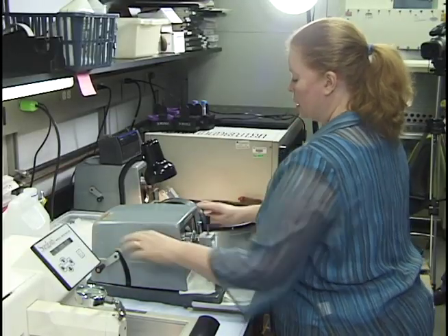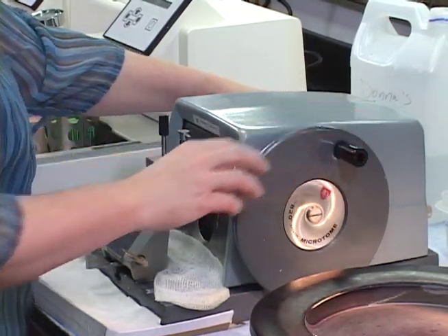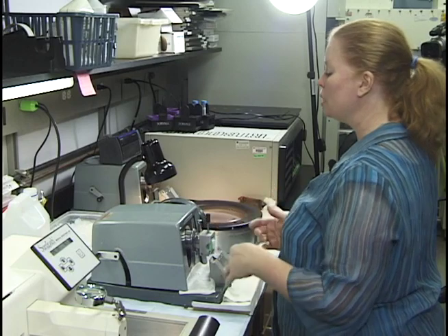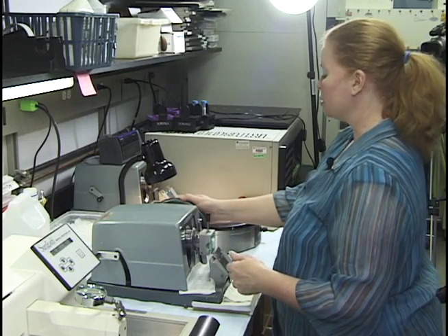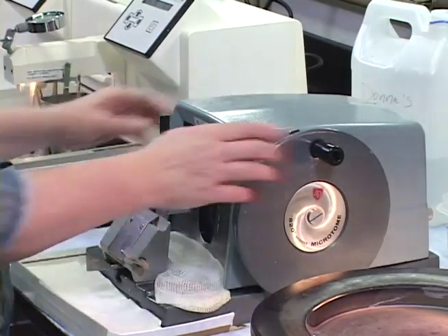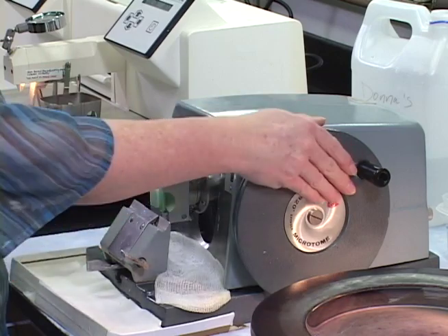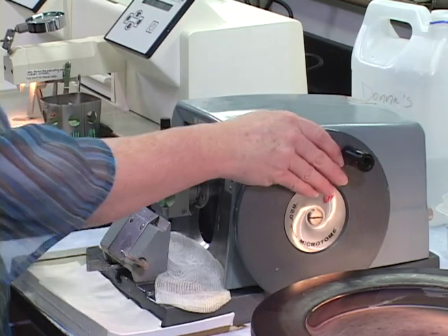So if you have this in this position, you can retract it or advance it, or this position. If you're in the wrong position and it wants to grind or anything like that, stop. Do not let it do that. You're in the wrong position and you're actually grinding the gears. So you want it past that point, just a little past or beyond. See, then it goes nicely. You don't hear that grinding noise. Or you can have it here and you don't hear the grinding noise. Okay, if you start hearing grinding, stop. Move the flywheel back or forward a little bit.